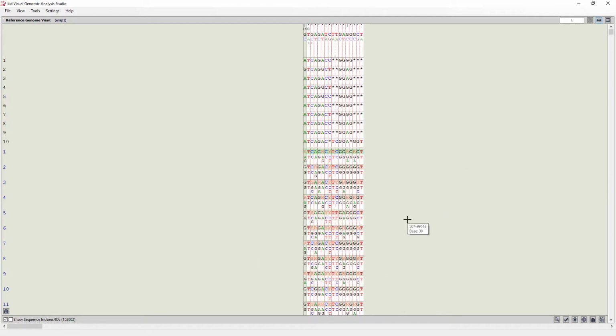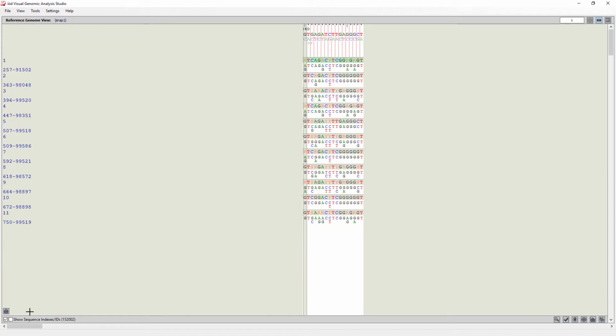The coverage info for each sample will now be displayed below the sequences in the sequence viewer. If the viewer height is too small to display all the coverages, then the Padlock button at the bottom left will unlock the display.